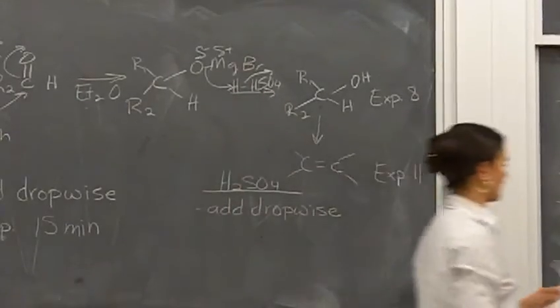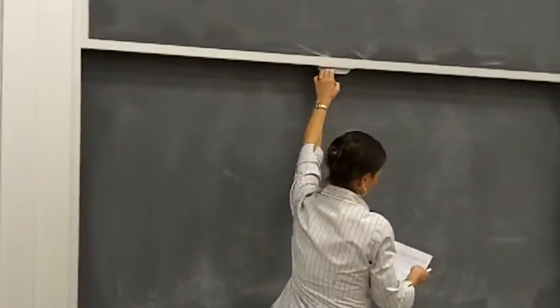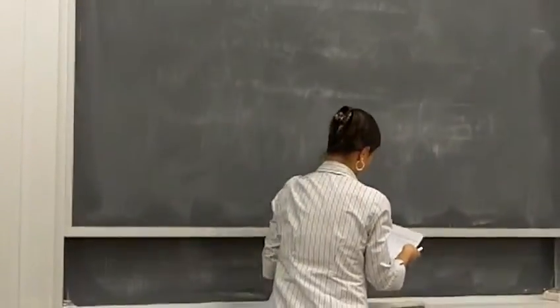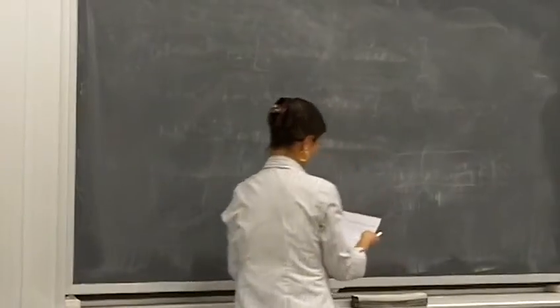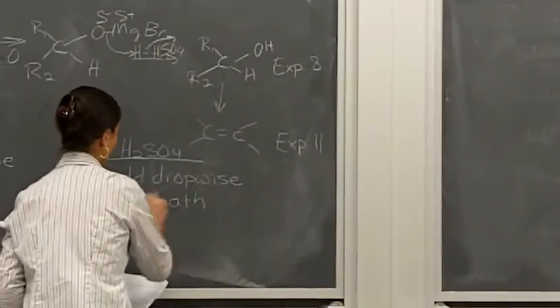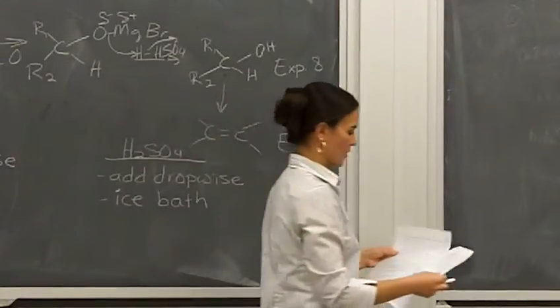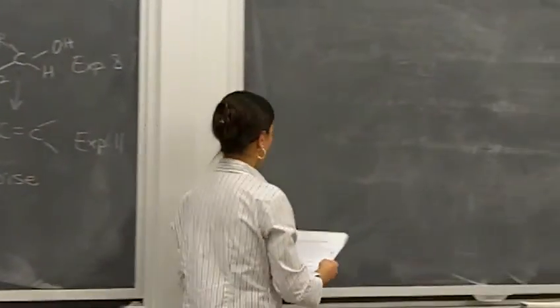And there's a couple different things happening with that addition. The other thing when we're adding this is we're in an ice bath. So now we will use an ice bath, okay, because we don't want this getting hot. The other two additions, we're letting things reflux. This one we don't want to.